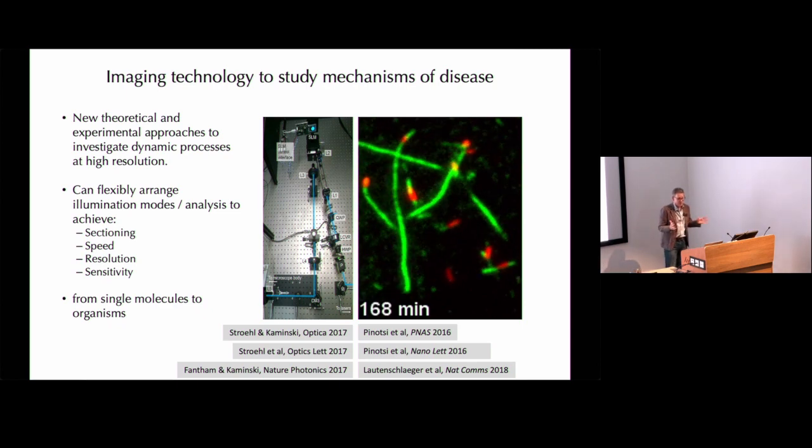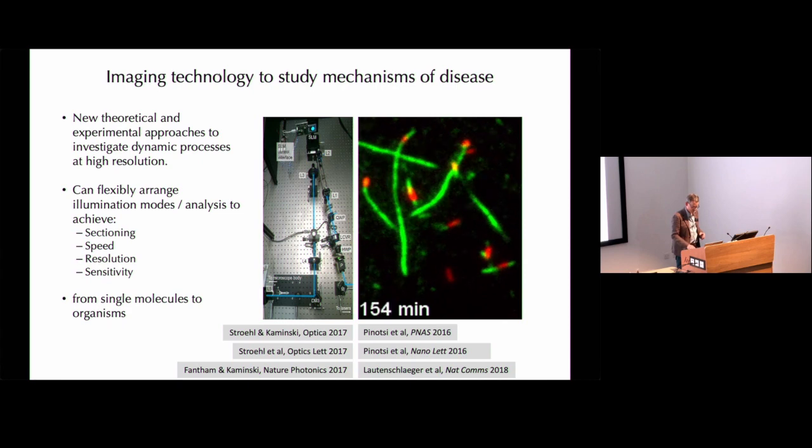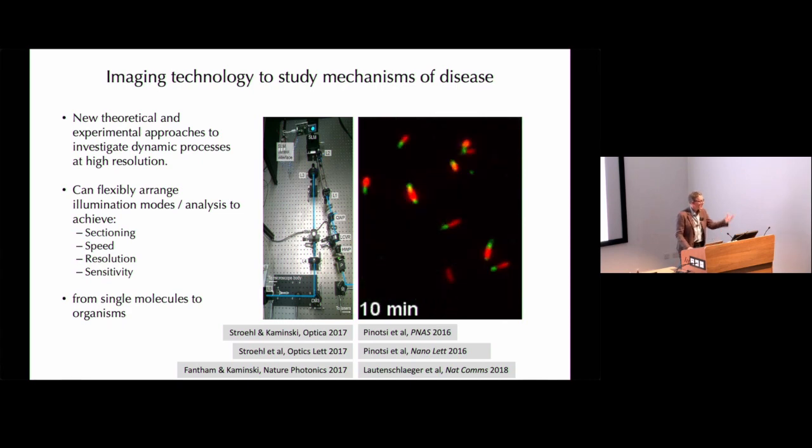So I'm talking particularly today about a technique called structured illumination microscopy and developments we've made in that field, and I will show you how we use it to look at organelles and give you one example. Namely, we look at the dynamics of the ER.